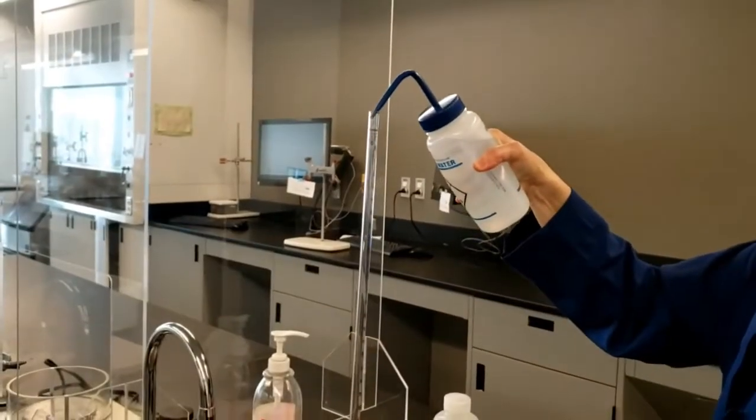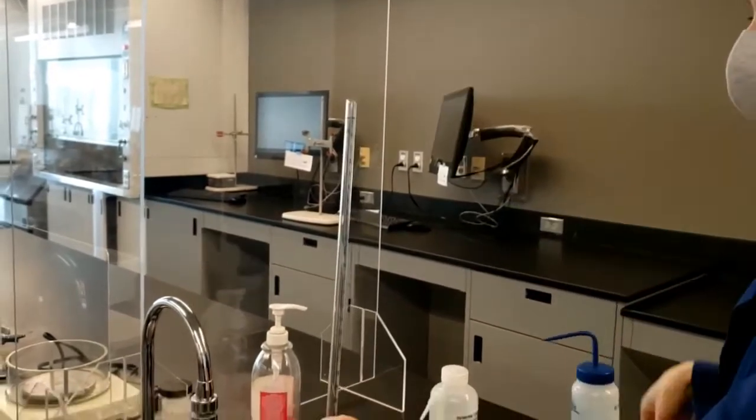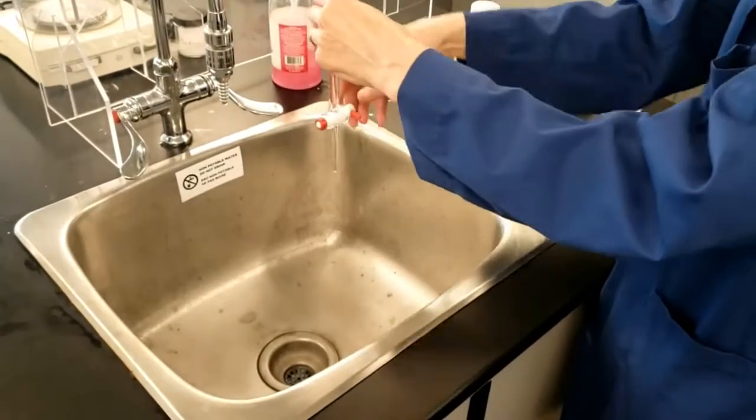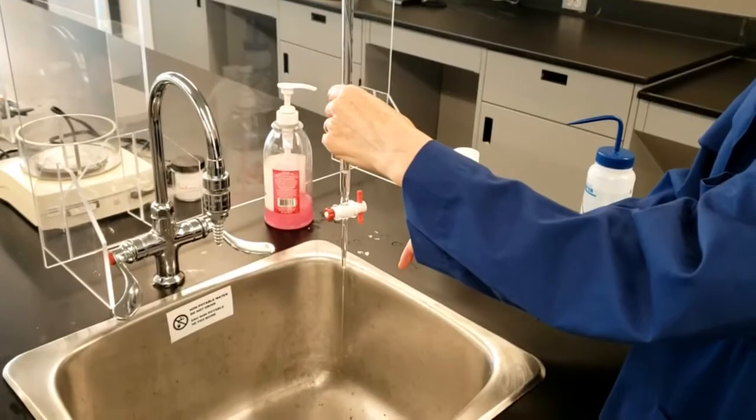Rinse the burette 3 times with deionized water. This can be done by quarter filling the burette with deionized water, then tipping and rotating it so that the entire inside is coated with water. Next, hold the burette upright and turn the stopcock, allowing water to drain into a refuse beaker or the sink as shown in the video. Note the coating of the water on the burette walls.